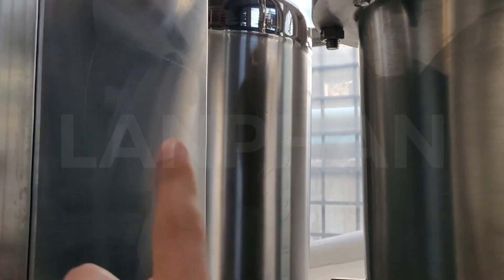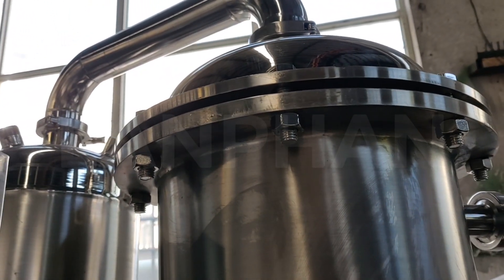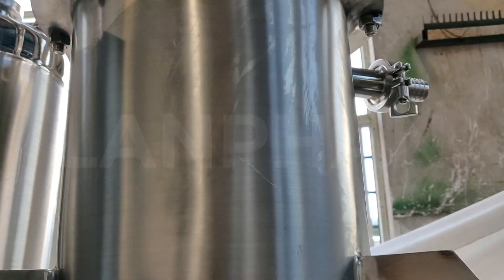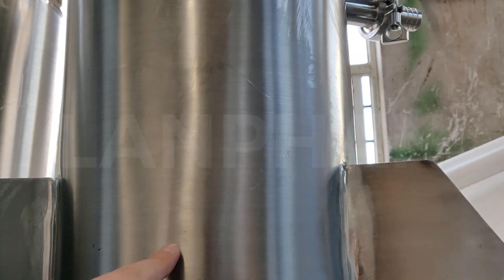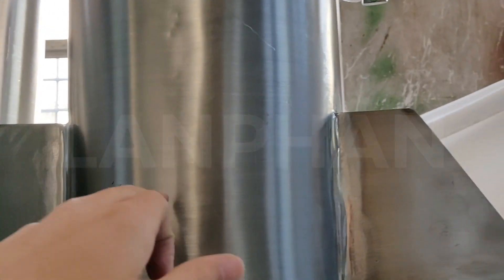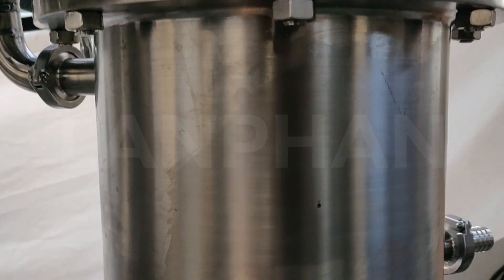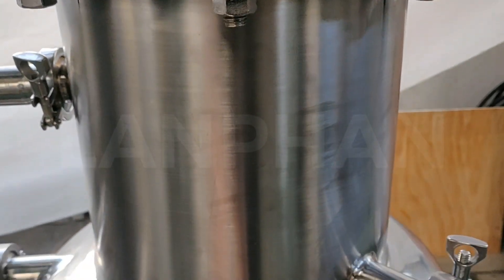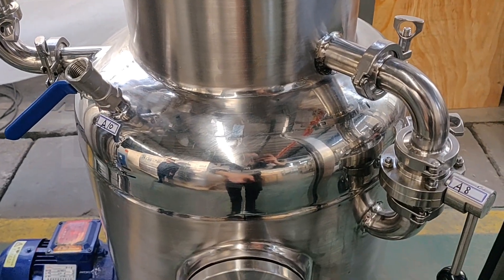The vapor will continue to go up to the top of the condenser. After reaching the condenser, the steam will become liquid and will fall down and be collected in the tank. This is the collection tank.